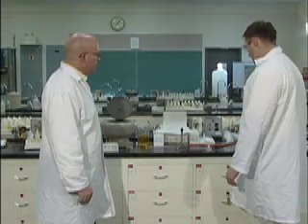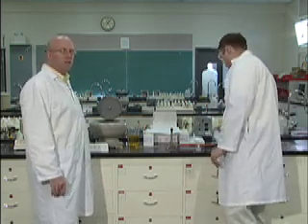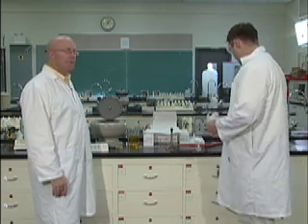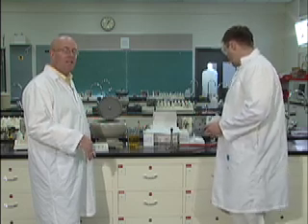Got to be sodium. So in this unknown solution, we have aluminum, iron, sodium, and silver, and that's it. All right, and those are our cations. And then we do similar kinds of things for our anions. Exactly. All right. So that is about the lab for today. It's taking an unknown solution and doing various tests on it, to determine which ion, either a cation or an anion, exists in that solution. Exactly.